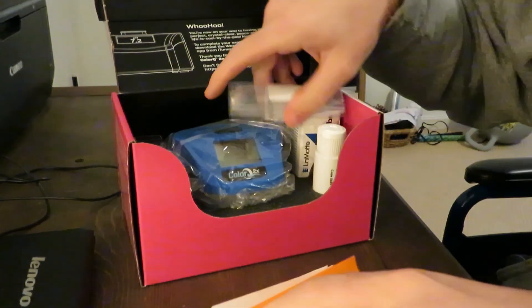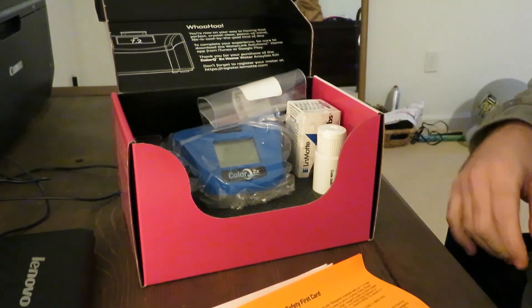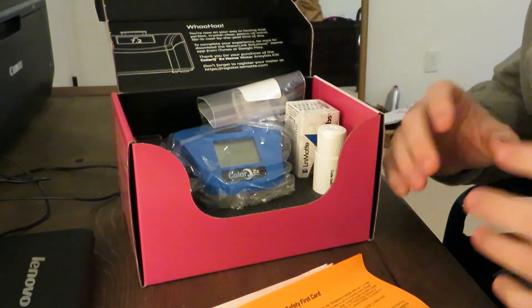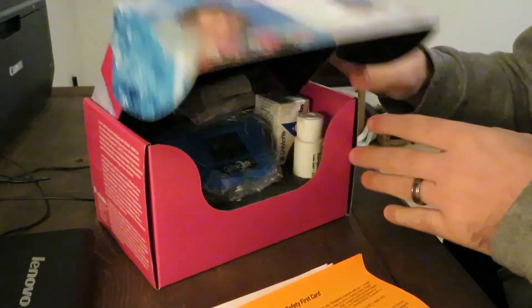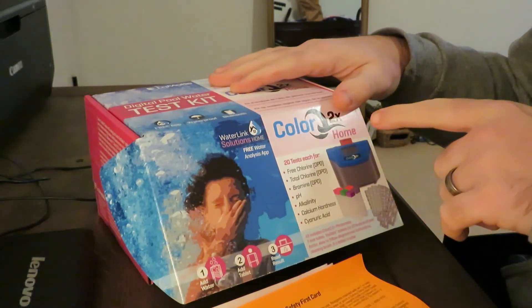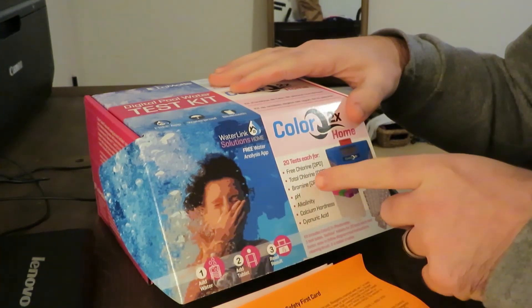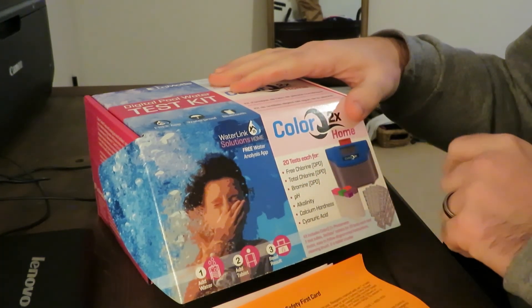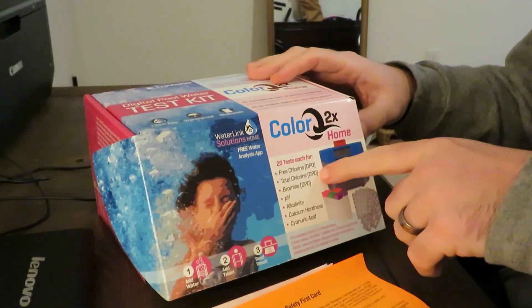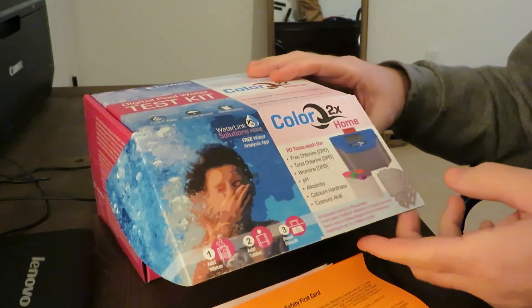It's got some safety information. This particular kit comes with 20 different reagents and test tabs to do 20 different tests for all the different parameters. This one tests for free chlorine, total chlorine, bromine if you're using a bromine pool or spa, pH, alkalinity, calcium hardness, and cyanuric acid. Using the free chlorine and total chlorine, you can determine your combined chlorines.